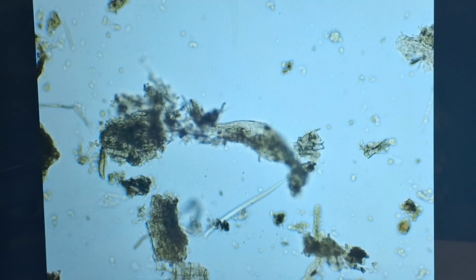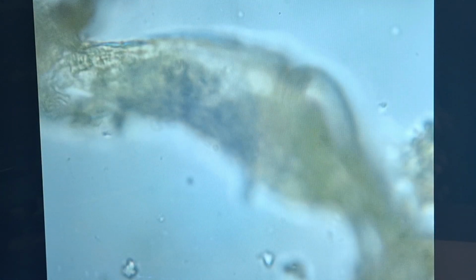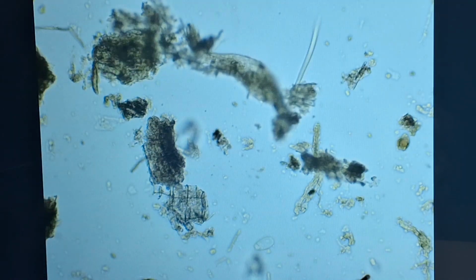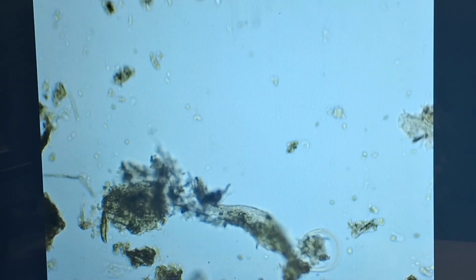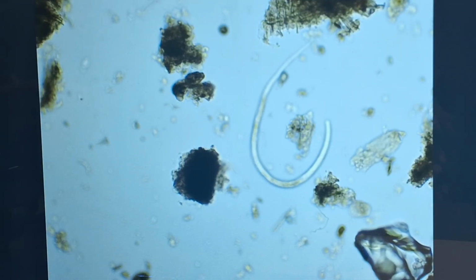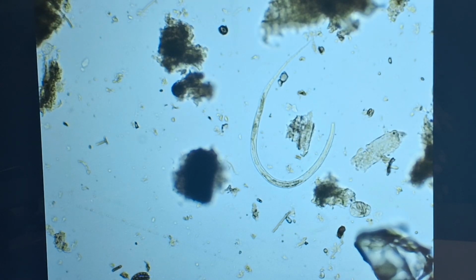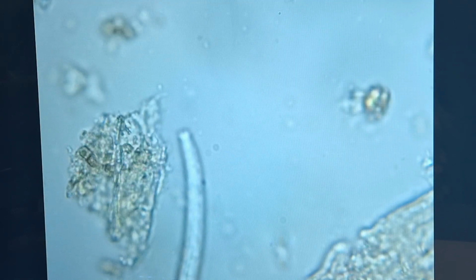We tell the nematode by its mouth parts. This one's moving so much, we're not going to be able to see much of the mouth. I'm going to find another one that's more calmed down. We'll be back. Oh, there's one. It's sleeping or not alive. Oh, it's alive. It's moving. So let's zoom in as quick as we can before it wakes all the way up. You need to look at his mouth parts. There we go. So this one's a bacterial feeding.